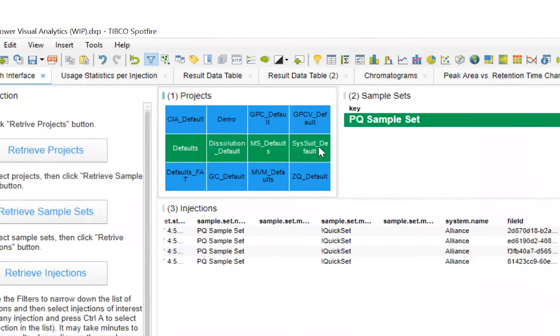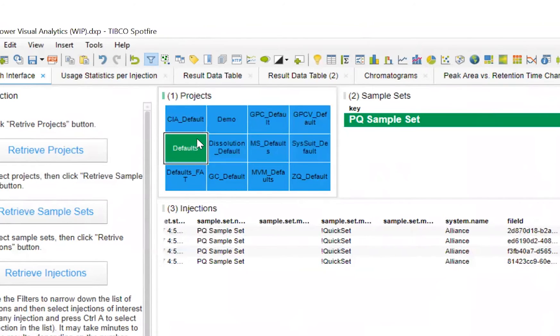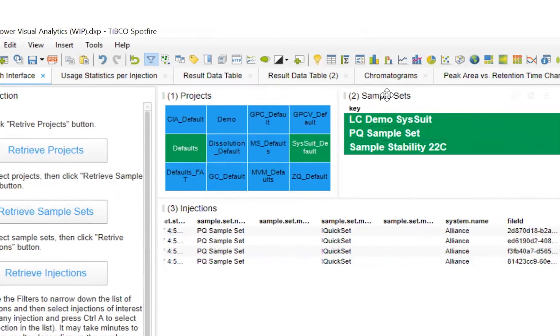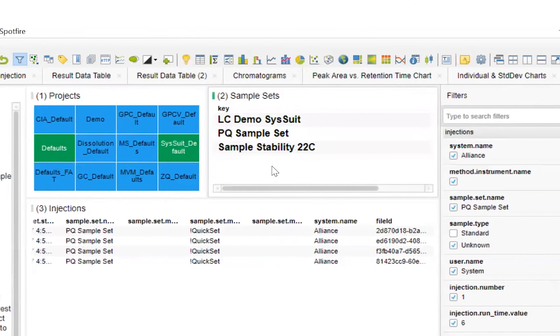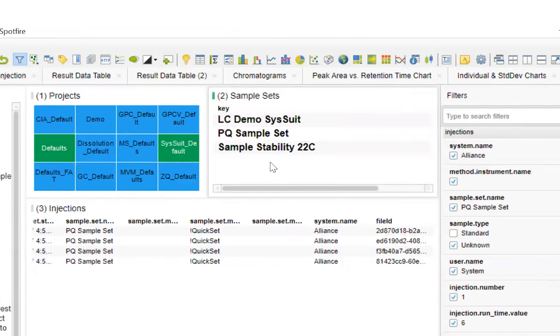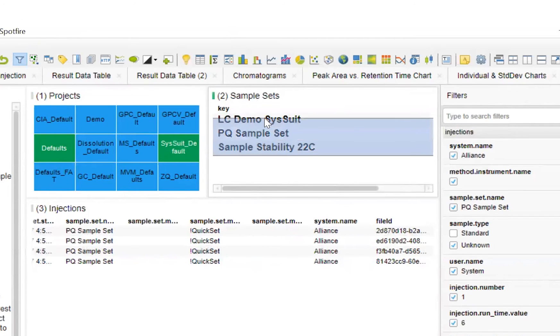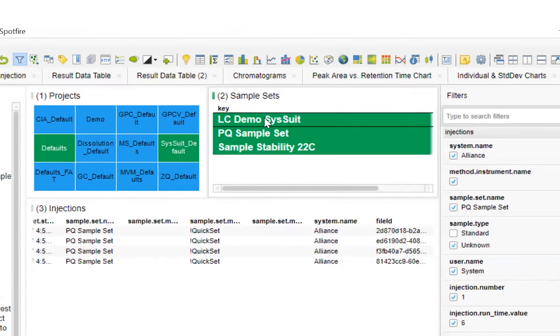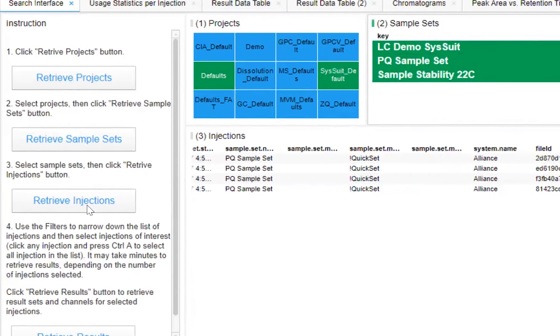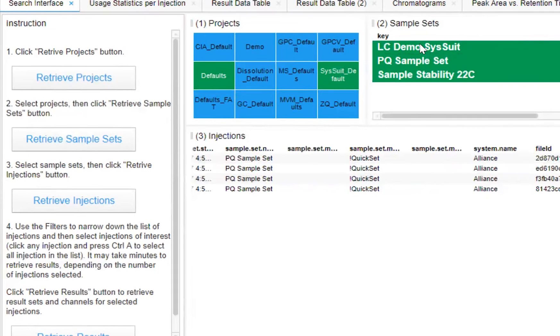It's easy to make selections of the data we require, and the projects we select are populated in the sample sets. The sample sets appear in the sample set window, where we can similarly make selections just as we did with projects. Here we'll select all sample sets and retrieve all injections.